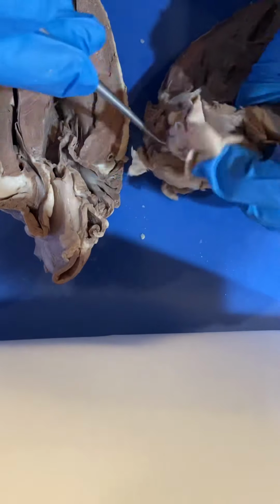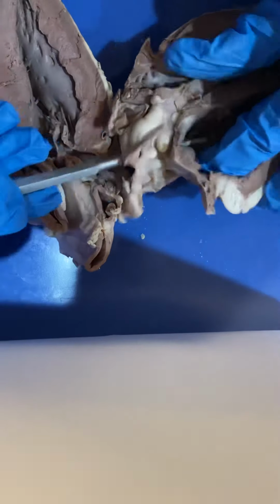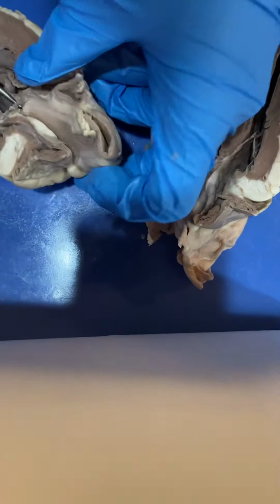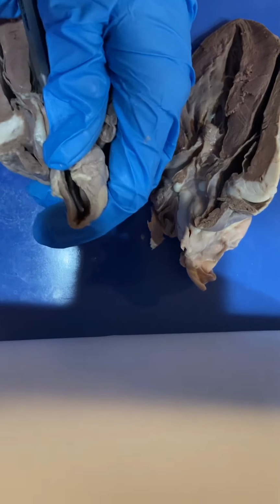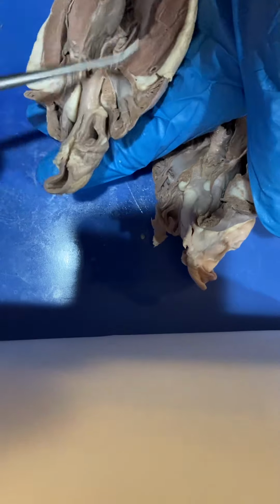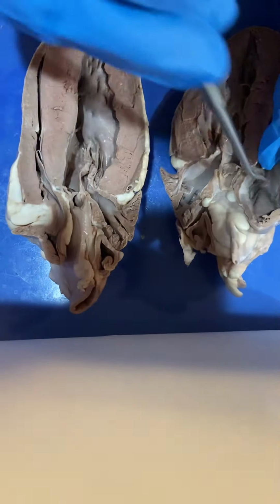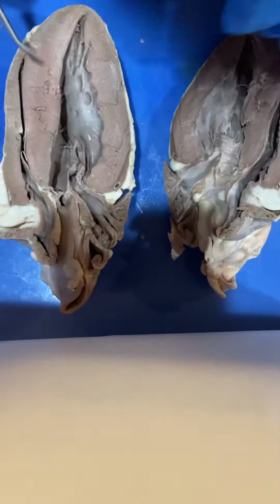If I can get it to come out here. So yeah, you'll see it'll come out right here is the pulmonary trunk, and it goes all the way through to the right ventricle. Now on the left ventricle, it is going to come out the aorta, which is a very key feature here. And you can see this is where the aorta comes, and it will come out the left ventricle. So here are the two different atriums. You got the right atrium and you got the left atrium.